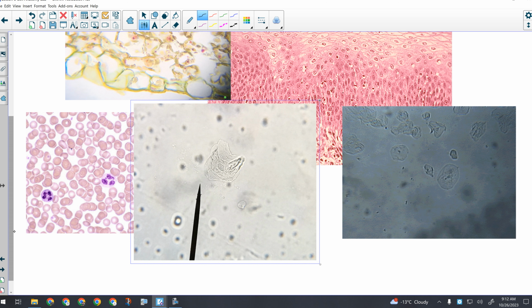Okay, so now when I put it on there, I do the same thing. I'm still twisting it, but I'm smearing it back and forth as I do so. Okay, just like that, a couple of times. Drop a water cover slip, put it under the microscope. You've got cells on there. Okay, that's why they can do DNA tests like in CSI, just by swabbing the inside of somebody's mouth. It's exactly the same thing. Lots of cells will come off because the inside of your mouth sloughs cells really, really easily.